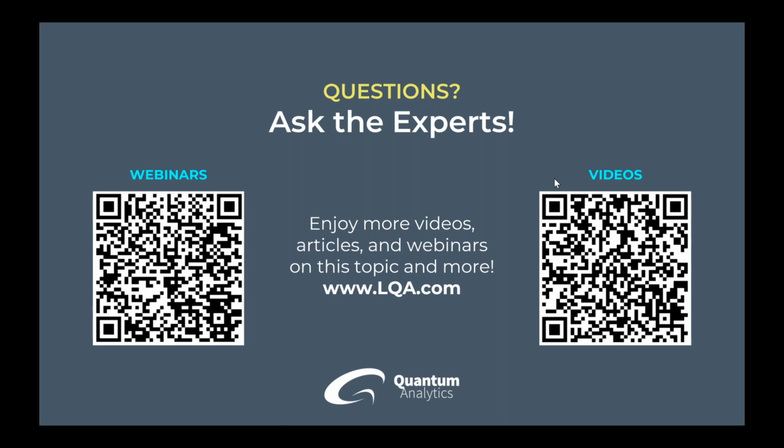Awesome. And can I also analyze light additives using thermal desorption GCMS? Yes, depending on how light you are thinking to analyze the additive. As we showed in the system configuration, there is an accessory or add-on called the microjet cryotrap that uses liquid nitrogen, and it will trap and focus those volatiles and light compounds for you at the head of the GC column. Because it is using liquid nitrogen, it goes down to -196 degrees Celsius, so you'll be able to trap and focus those types of light and volatile compounds.